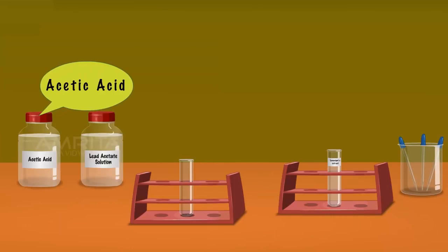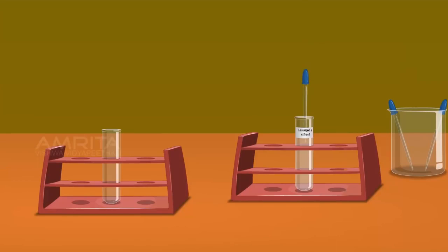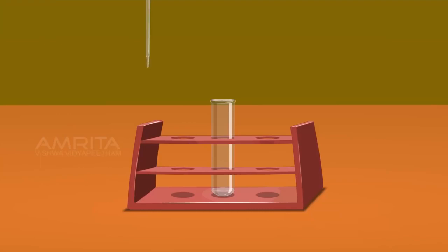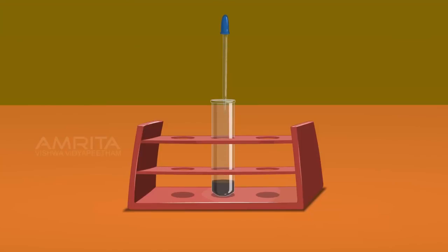Lead Acetate Test. We require acetic acid, lead acetate solution, test tube, Lassaigne's extract and droppers. Take a small amount of Lassaigne's extract using a dropper and pour it into a clean test tube. Using another dropper, take a small quantity of acetic acid and add it into the test tube containing Lassaigne's extract. Take a small amount of lead acetate solution using another dropper and add a few drops into the contents of the test tube. Sodium sulphide formed during the preparation of Lassaigne's extract reacts with lead acetate and forms a black precipitate of lead sulphide.